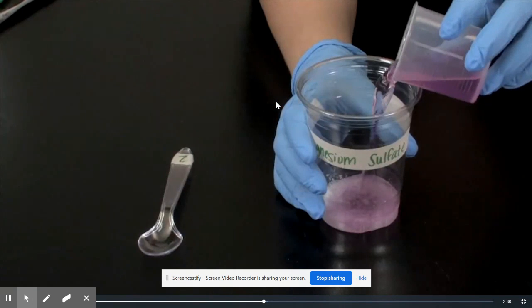All right, so I'm going to pause it right there. The first one you should have done was the sodium bicarbonate. For the mixture, there was a color change. It turned from purple to blue, or like the cabbage juice to blue. The temperature change did occur and it was a decrease, but you didn't see any gas or any precipitate or any evidence of a chemical change.